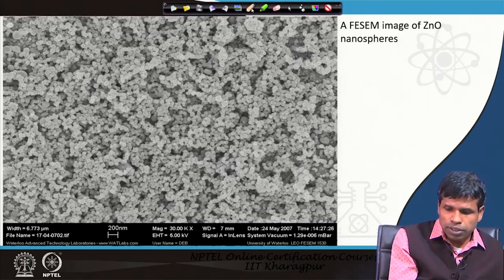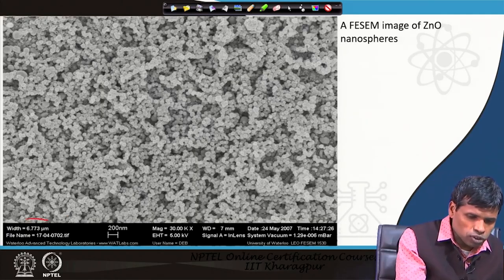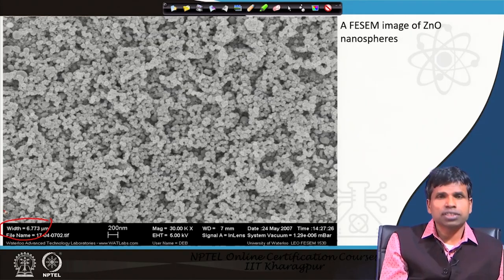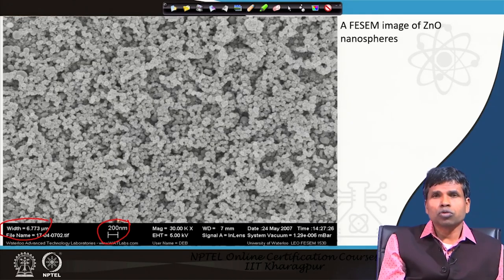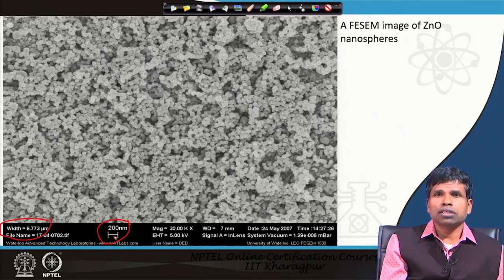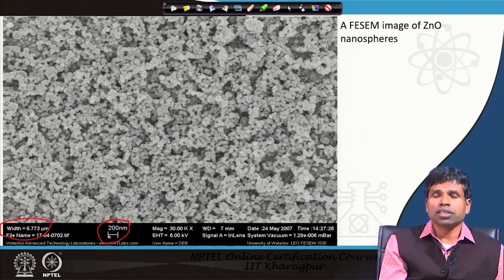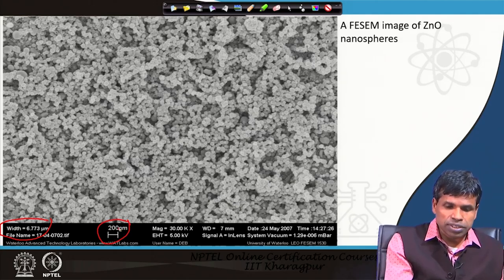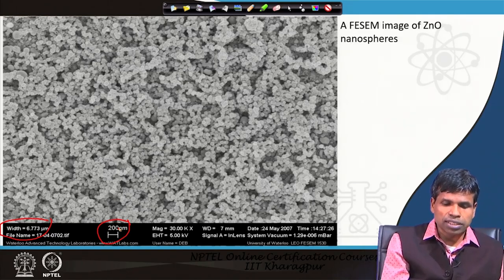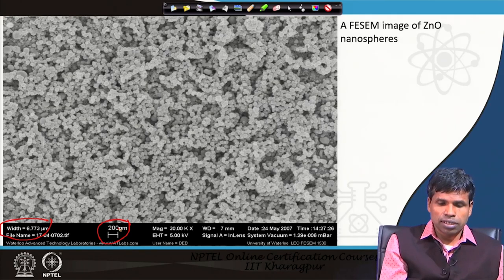In the bottom bar there is important information. In the leftmost corner is written 'Width', which is the width of this image from left to right: 6.773 micrometers. There is a scale bar of 200 nanometers shown as a white line, used as a reference standard to measure the size of individual spheres in the photograph. If this bar is 200 nanometers, then we can see that the spheres in the photograph are approximately 50 nanometers in diameter. This tells us the size of individual spheres in our sample.